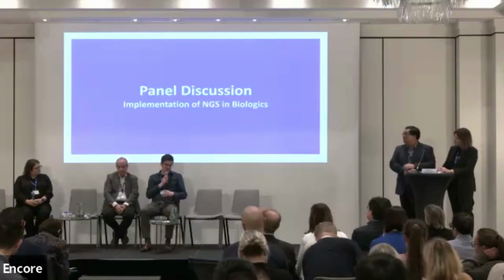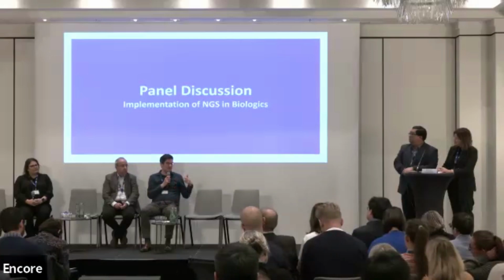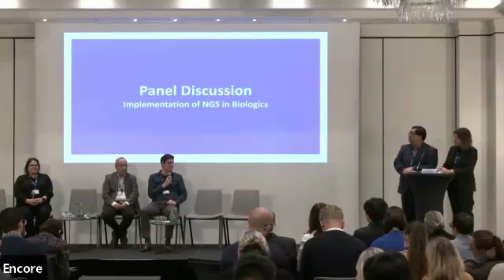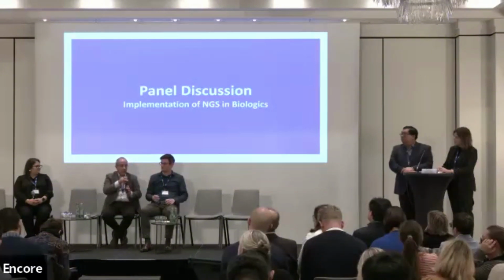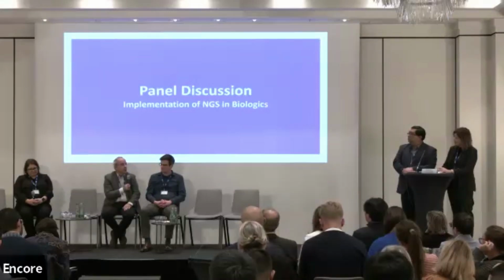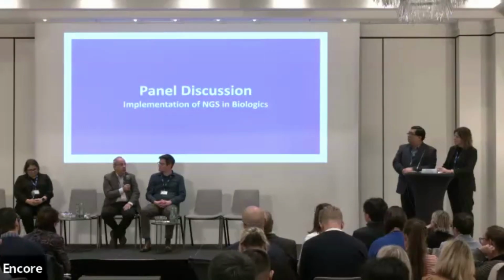I can say, we're in study 5, the FTIC study 5. And the nice thing about Kamer is that it's read length agnostic. So we did have other machinery in mind, thinking beyond Illumina. We haven't really done much with it, but we're planning to use this pipeline for study 5. In terms of our own pipeline, it is adapted for short read, but being modular, not all of the modules will be impacted by long reads. So we would need to look at them and adjust them. We're still exploring long reads in the lab right now.